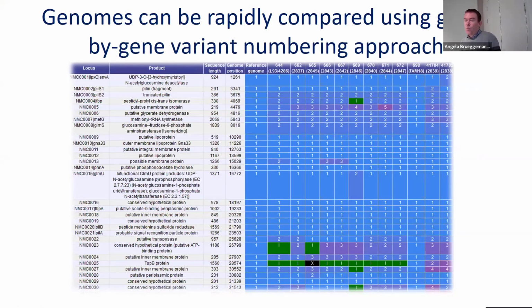And then once you've done that, once you've scanned it, and this used to take a long time because, as you can imagine, the first version was very naive, it scanned each locus in turn, did a separate BLAST query for each locus. And that was fine when we were only looking at 2 genomes. It still took an hour, but it was fine. Trouble is, if you make something available on the web, people will always try to push it. The data sets get bigger and bigger and bigger, and it gets to a point where either you can't support that, you have to limit what people do.